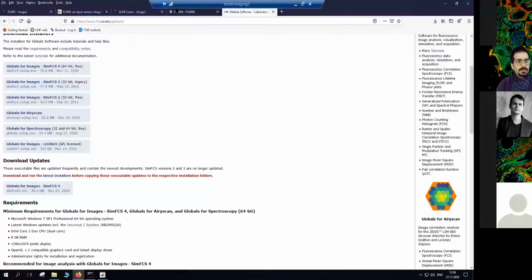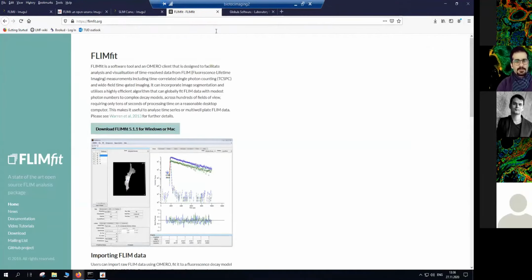Another one is FLIMfit. I think that's one of the most famous ones, and it might be one of the old ones which are still available. This software was developed by Sean Warren and others in 2013, and it is still functioning very well. It's based on MATLAB. For a while now you can analyze the data in FLIMfit in collaboration with OMERO, so you can have your data on OMERO.